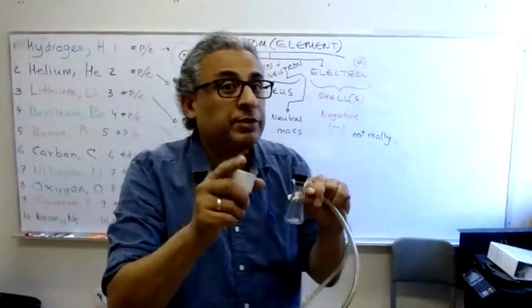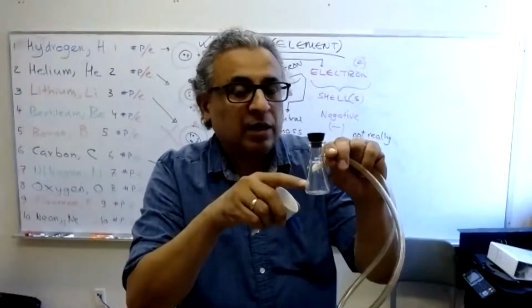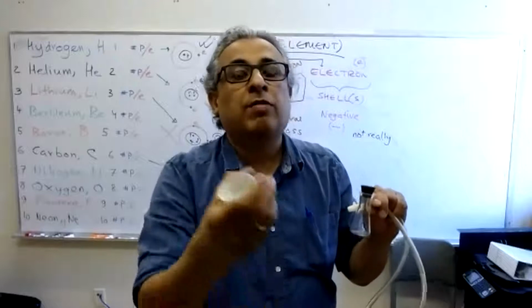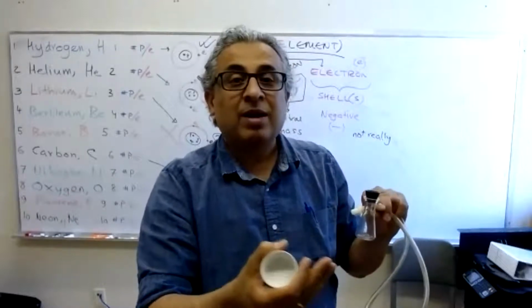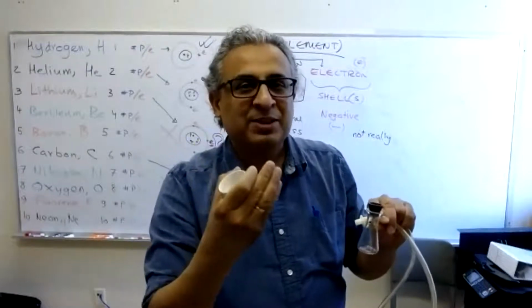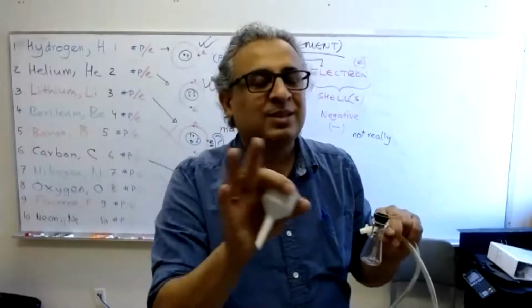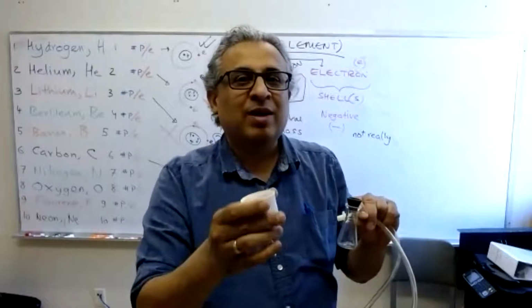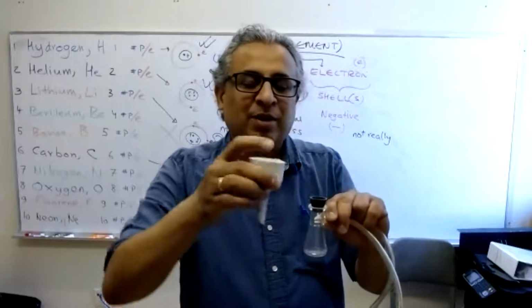You do vacuum filtration when you need the solid and not the liquid, not the filtrate. Let's say you recrystallize sugar from water, from your last night's lemonade party. You'd have to be a real penny pincher to recrystallize your sugar from the leftover lemonade, but this is just for the sake of argument. And you're collecting the sugar that crashed out from water after the recrystallization, and you're collecting it here.